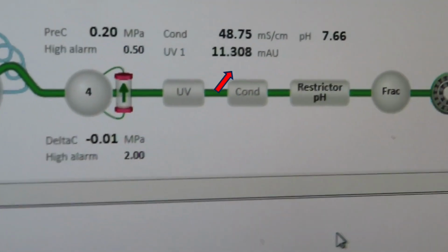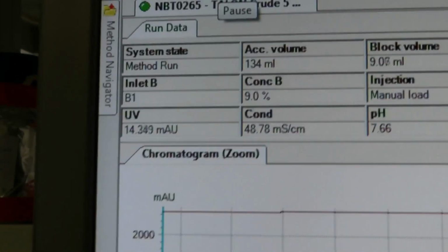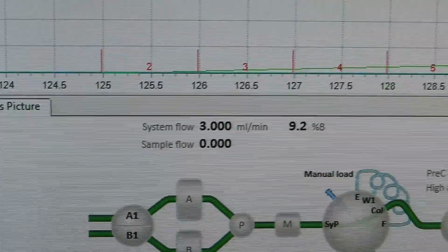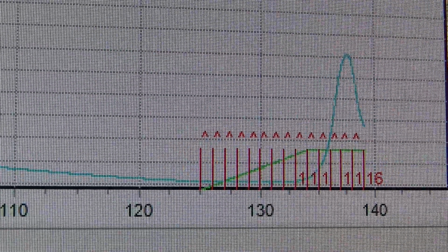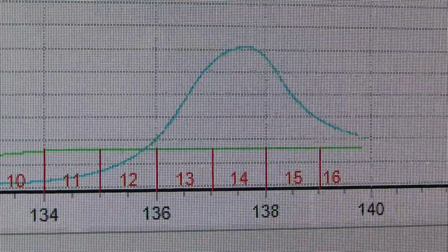During the elution, a rapid increase in the ultraviolet absorbance indicates a massive elution of proteins. At this point, the gradient must be stopped and the same concentration of the elution buffer maintained in order to avoid the overlapping of different eluted protein populations. The ultraviolet absorbance shows a peak profile that can be correlated with the fractions collected, clearly seen in this zoomed view.